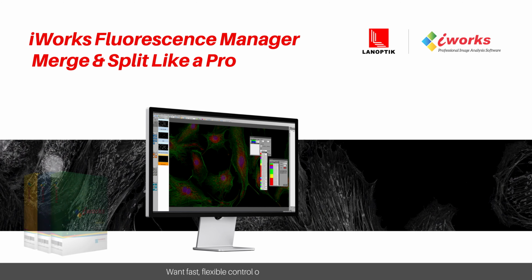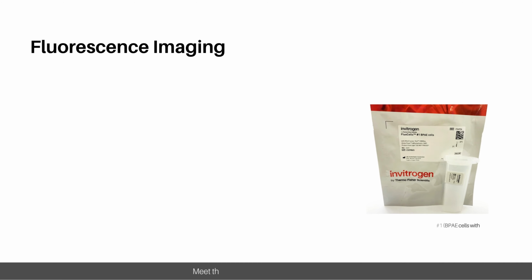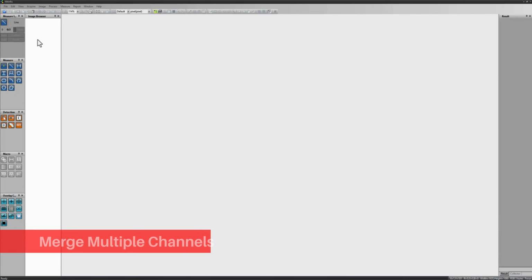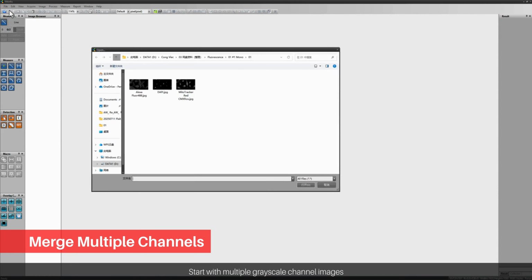Want fast, flexible control over your fluorescence images? Meet the Fluorescence Manager in iWorks. Merge multiple channels. Start with multiple grayscale channel images.